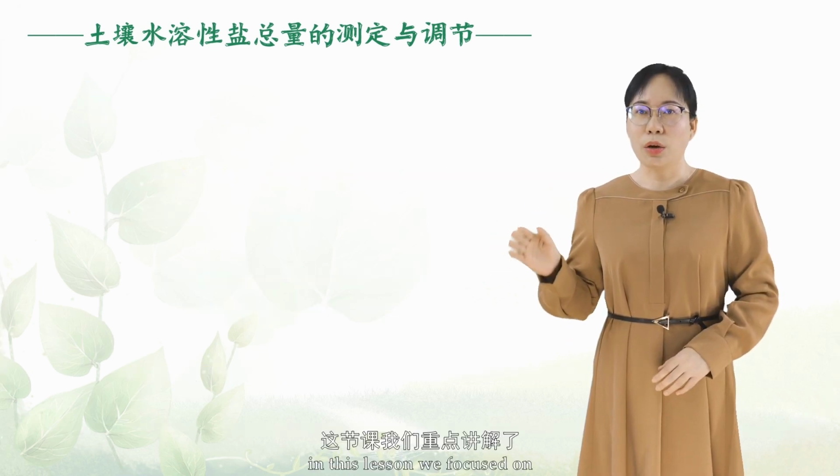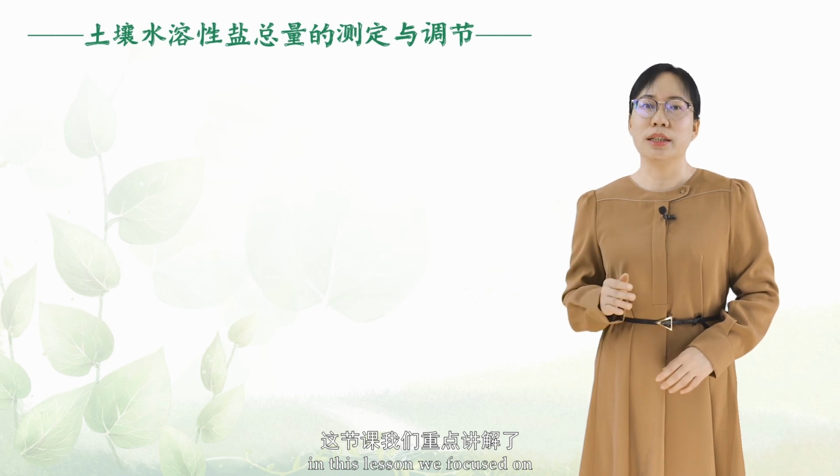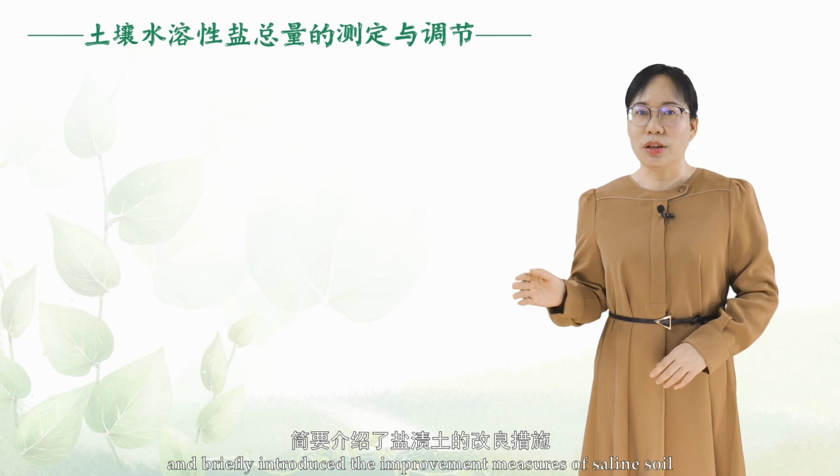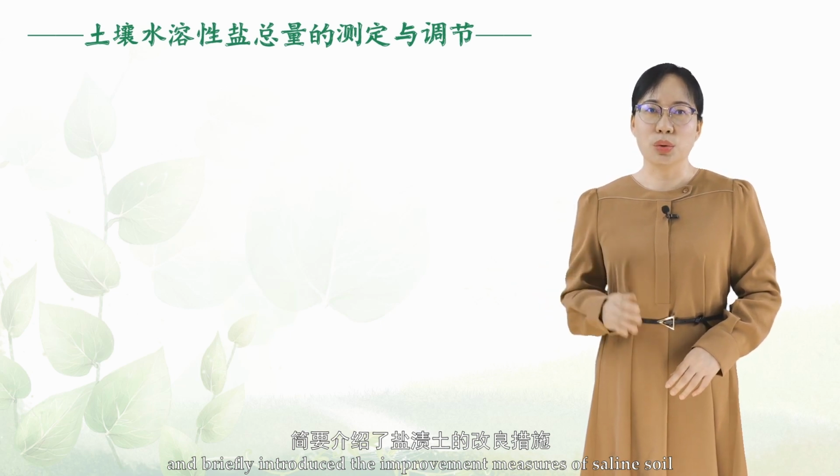Well, in this lesson, we focused on the determination method of total water-soluble salt in soil and briefly introduced the improvement measures of saline soil.